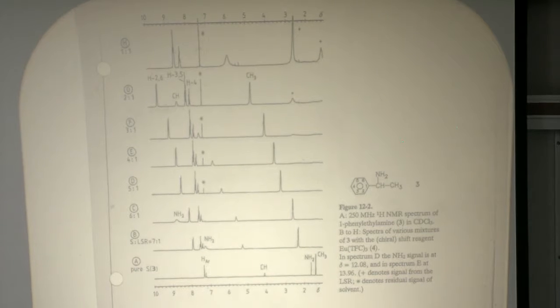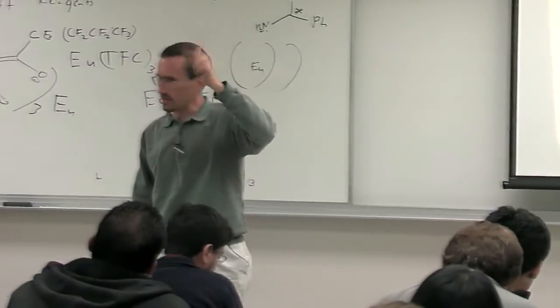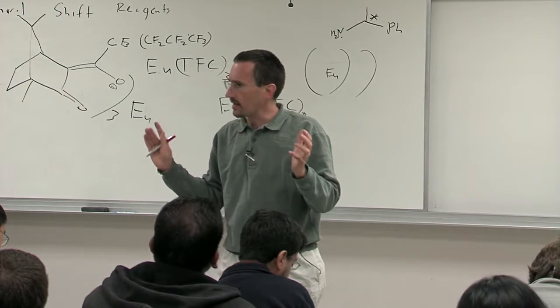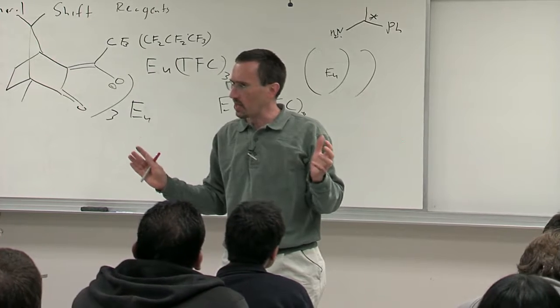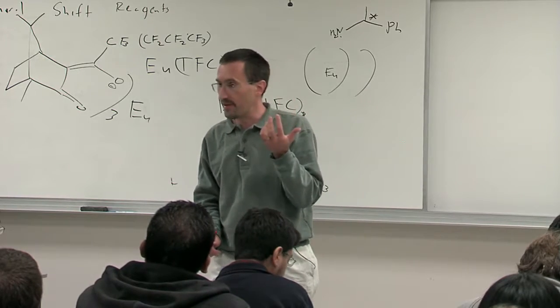If your proton is flipping spin states on the order of 10 milliseconds or 30 milliseconds, your line's going to be very fat. Remember, we deliberately added paramagnetic reagent, chromium acac, when we talked about the INADEQUATE experiment, because we deliberately wanted to get those quaternary and other carbons to relax a little bit faster.